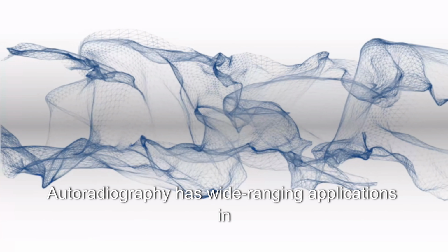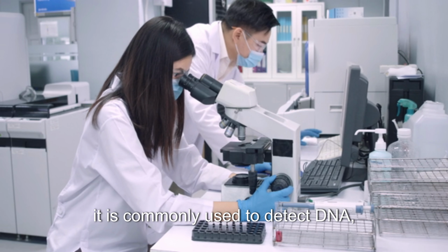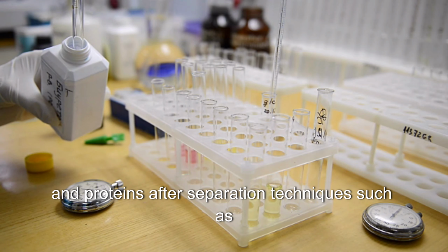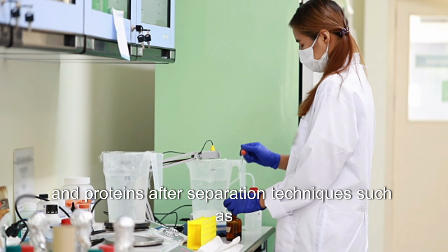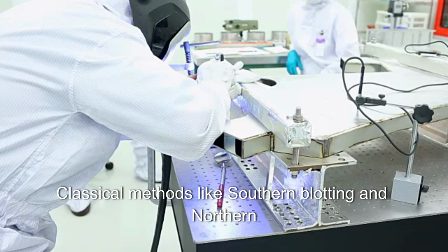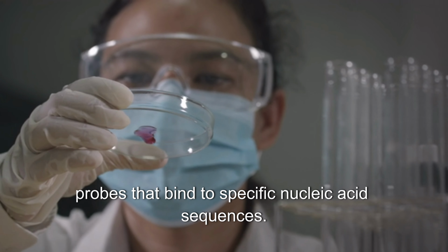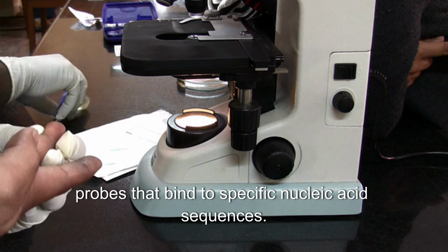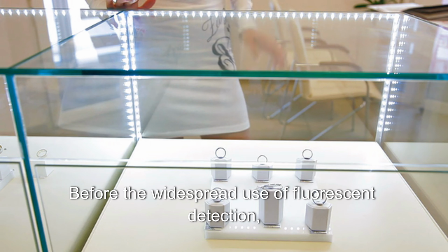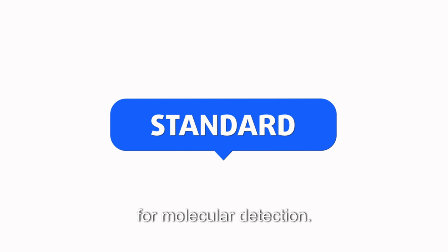Autoradiography has wide-ranging applications in biological sciences. In molecular biology, it is commonly used to detect DNA, RNA, and proteins after separation techniques such as gel electrophoresis. Classical methods like Southern blotting and Northern blotting rely on autoradiography to visualize radio-labeled probes that bind to specific nucleic acid sequences. Before the widespread use of fluorescent detection, autoradiography was considered the gold standard for molecular detection.